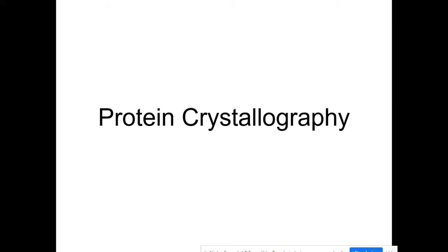And actually, right now at Brookhaven National Lab, all research work has ceased, with the exception of work focused on looking at the structure of the virus. So it's pretty important stuff going on, and protein crystallography is a huge field. So basically, the way it works is you want to grow protein crystals.